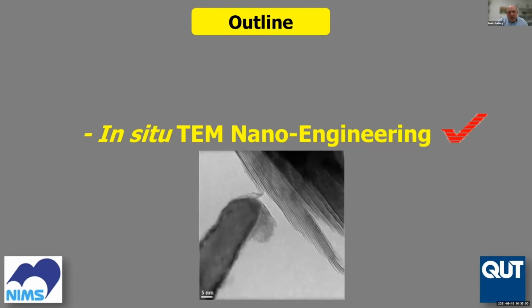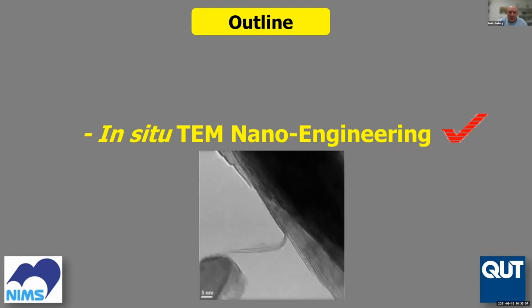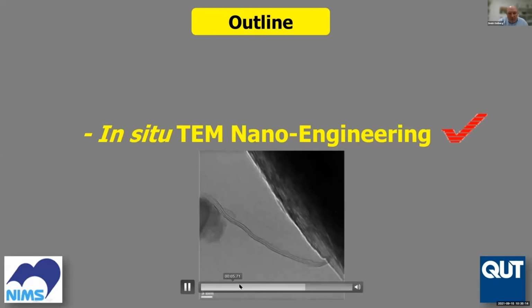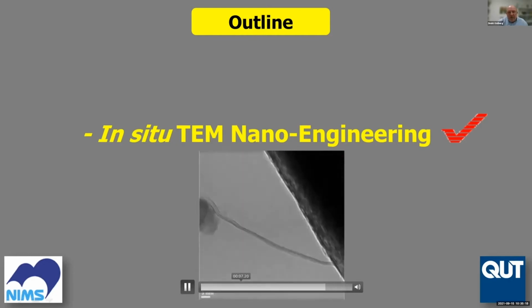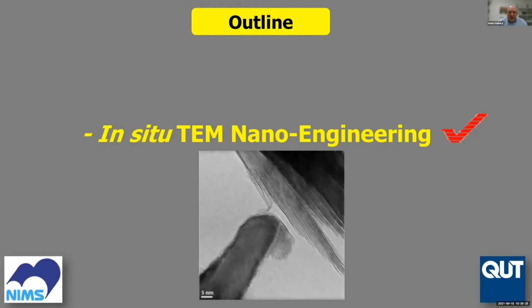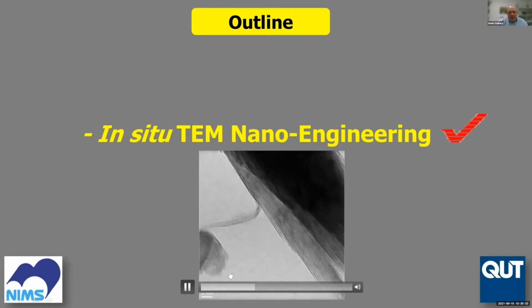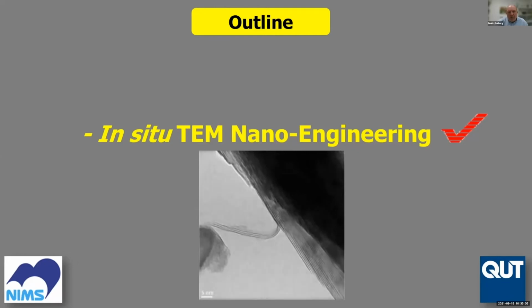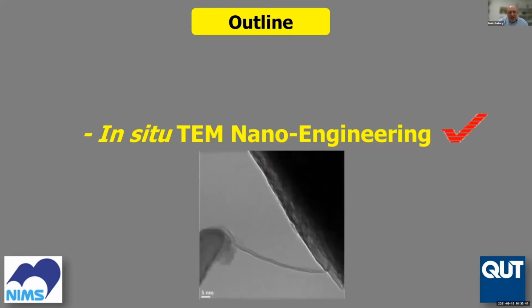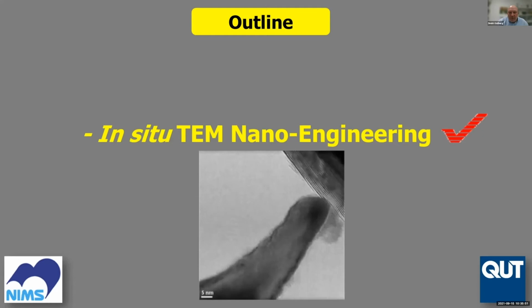And the next topic is called nano engineering, because you can play with different structures, with different single crystals, and get very nice imaging conditions for very thin structures. This movie shows you peeling of individual 3 to 4 atomic layers of molybdenum disulfide out of the single crystal. And you can see the precision of this operation is unique. And actually this process mimics the so-called Scotch tape technique used for peeling graphene out of graphite single crystals. It shows you what's happening in real time. You can detach these layers and put them back. It's a very flexible and very sticky procedure.